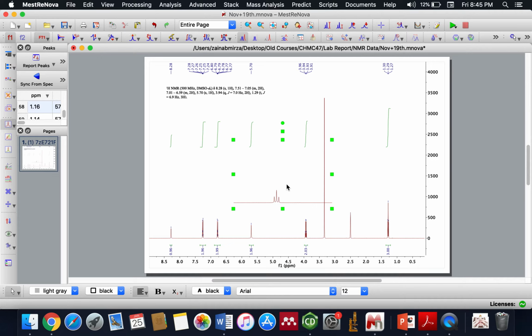You can, again, use your mouse pad to scroll up, right? And you can use the cut tool that we used previously to get rid of that extra region. We don't want that. And you can make it a little tall. Overall, reduce the size and just put it right on top of the peak that you just expanded. You can cut off a little more too. If that looks too wide, you can just make it a little skinny and it serves the purpose, right?